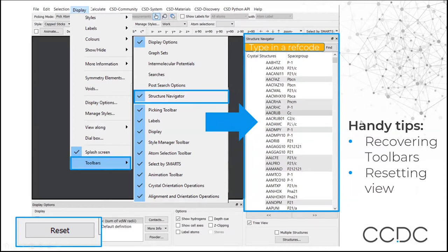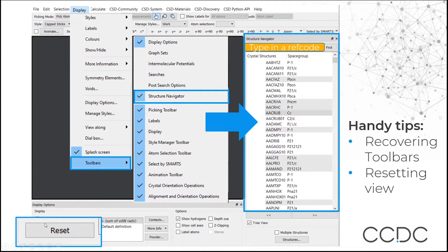You'll also see a number of additional menus on your Mercury interface. If any disappear, go to Display and then Toolbars, and select which toolbars are displayed. The toolbar that allows you to explore the CSD is the Structure Navigator toolbar — if it disappears, go to Display, Toolbars, Structure Navigator. There's also a useful reset button on the bottom left. As you play around with the display, if you want to return to default settings, press Reset.